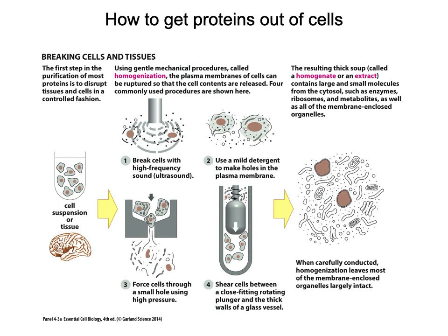It's a specialized piece of equipment, so probably not as common. The more common method in order to create a homogenate is to use mild detergents. So this is where you might add something like a Tween solution to the cells. Tween is a kind of brand name of detergent.